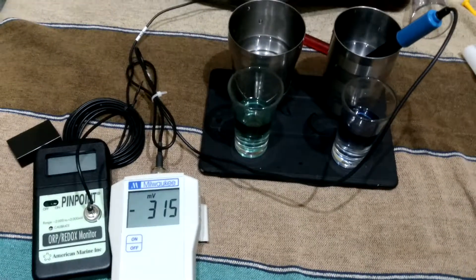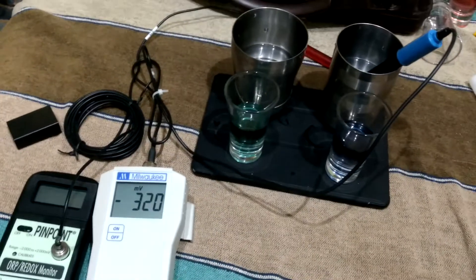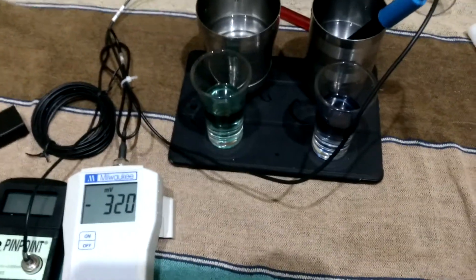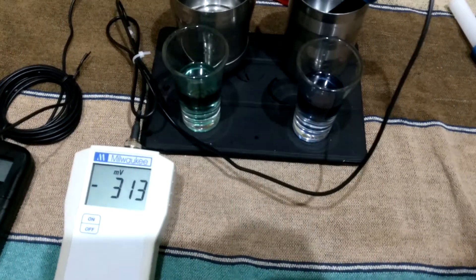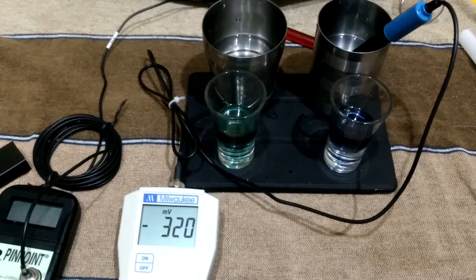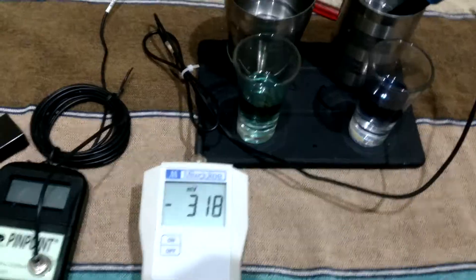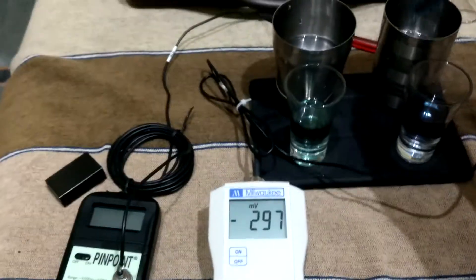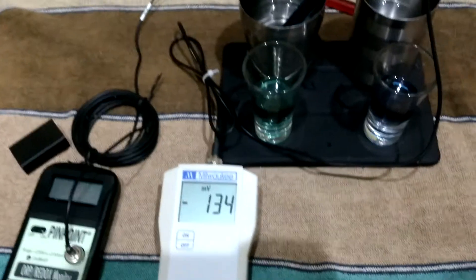Let's see - 317, immediately it will come. 320. Still at 320 and still decreasing. Okay, now I will put it in our glass because it is tap water. Let's see.